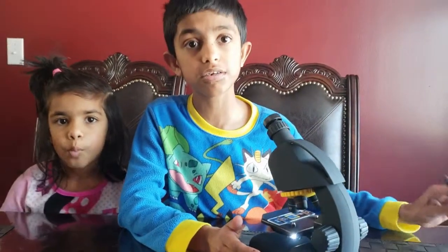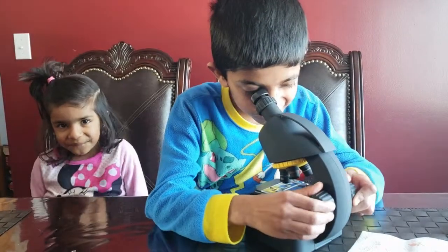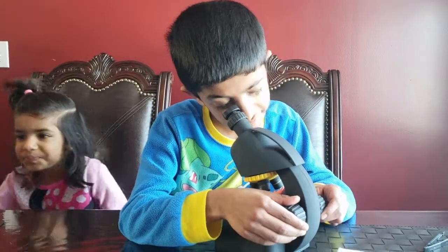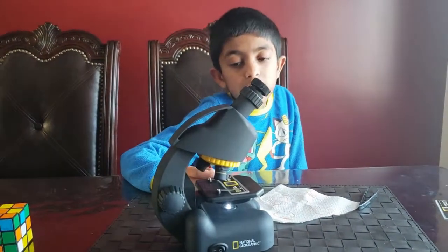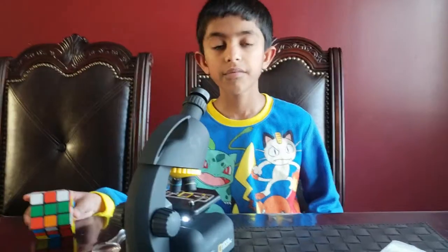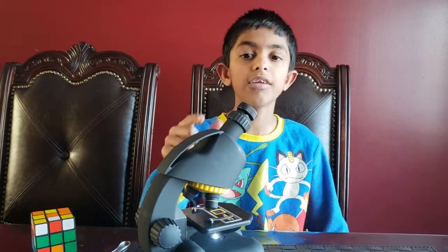To see all the cells in very detail, you have to find the right light. When you turn it on, the light goes through the hole in the stage, through the specimen. Light passes through the objective — which is this — then through the body, then through the eyepiece.